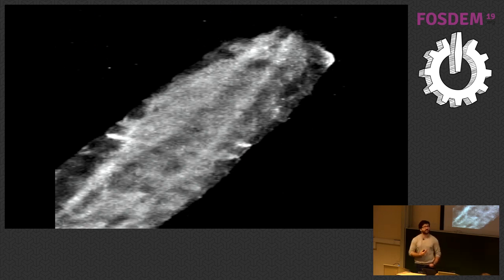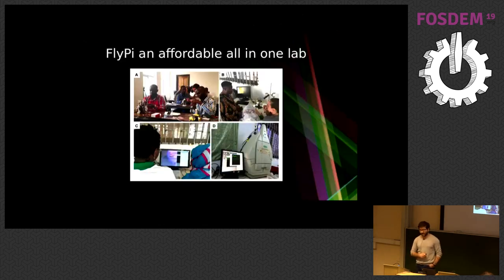And we're hoping, because this is open source, more people are going to pick it up, bring it to their own fields of study and help improve it. One thing that we've learned from learning by ourselves about electronics is that any biologist can learn it. And because we are part of this NGO that is trying to help development in Africa, we started doing courses where we teach researchers in Africa, inside academic institutions, how to put electronics together to build their own equipment, right? In Africa, AliExpress is also widely available, so you can get a lot of components there.